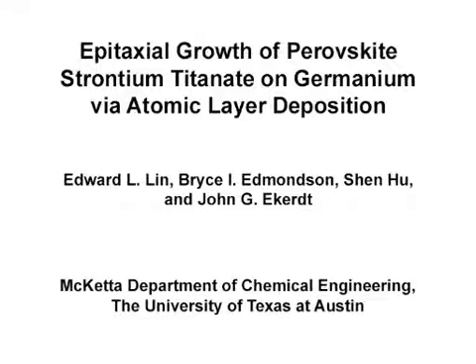The overall goal of this procedure is to grow high dielectric constant crystalline perovskite oxides in a scalable process to function as gate oxides directly on germanium, a future microelectronics platform.